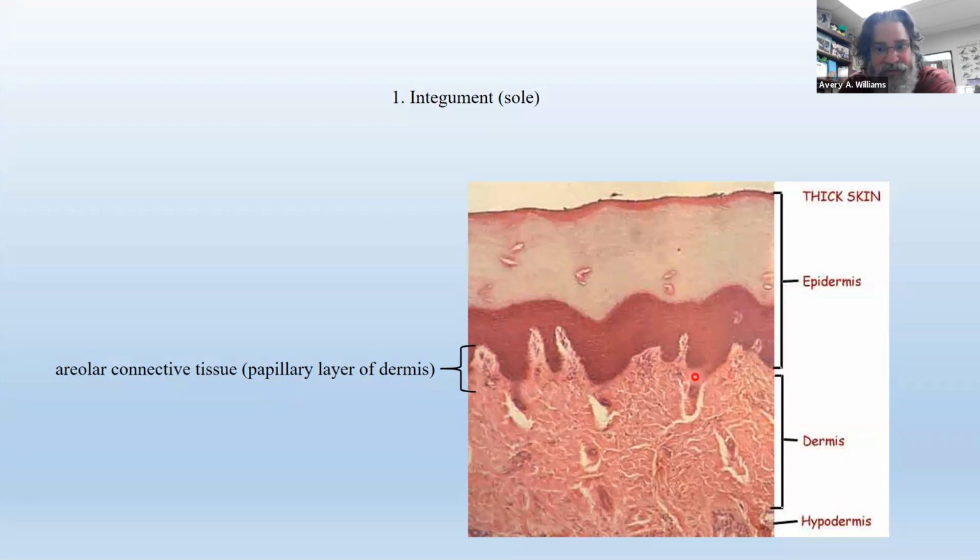It's a loose connective tissue. When you talk about connective tissue, connective tissue in general is a supporting and structural type of tissue. It provides support and internal structural integrity, okay? And it does so by different means, different ingredients, all right? Sometimes it's dense and thick, and sometimes it's loose and very delicate, all right? Well, this particular connective tissue that's filling these papillae is a loose kind of connective tissue, delicate.